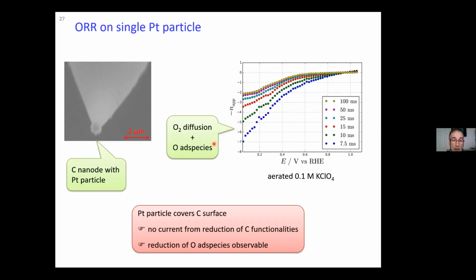And this is an indication that, again, we are probably reducing some oxygen species that haven't been completely removed during the conditioning.